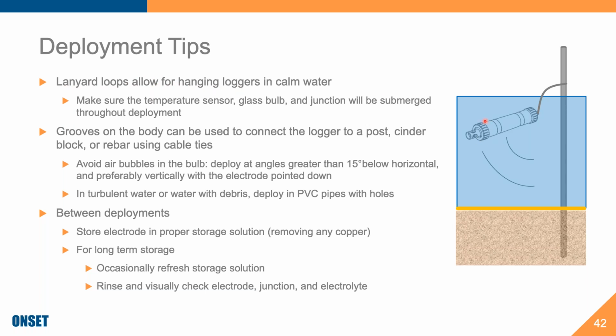But likely any data logger, like a multi-parameter sonde, or maybe a pH data logger that you have, will have very similar attributes. So what we have here is a rebar, my wonderful fake rebar, and a pH logger, with a lanyard hole and a lanyard attaching it to the rebar. So this is a nice way to hang your pH data logger or multi-parameter sondes if you're in water that is calm, so like a lake.